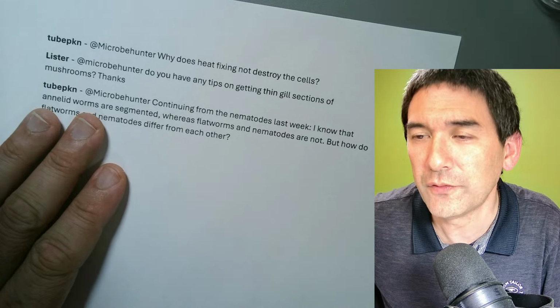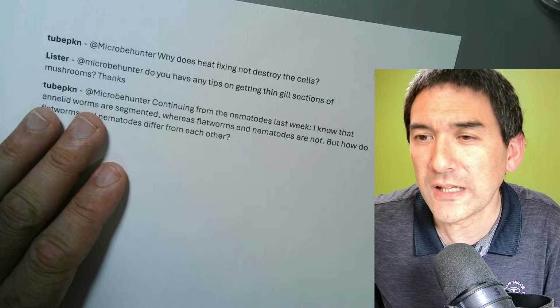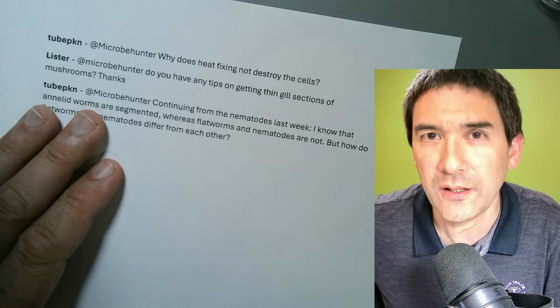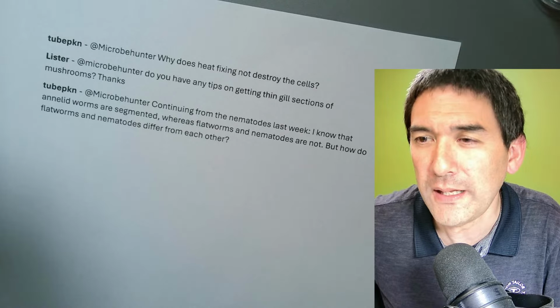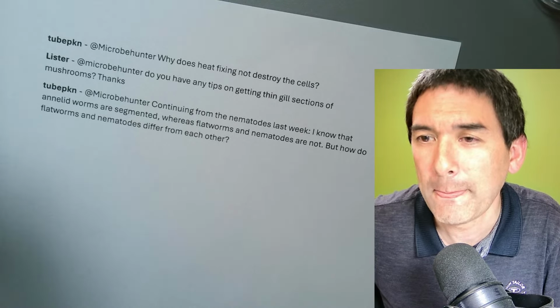Yep, I think most of the question... there's a comment here. I'm reading 19th century publications like Zeitschrift für wissenschaftliche Zoologie, and I wonder... So that's a basic Zeitschrift. It's a magazine for scientific zoology, in German, and I wonder if I could make observations like they did. Any recommendations in that regard?